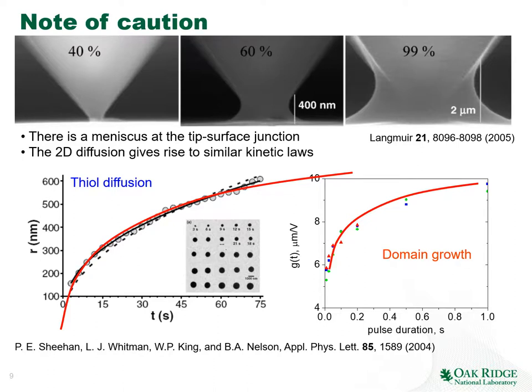It turns out if we just overlap these two curves, they show remarkably similar behavior. This is not a very rigorous comparison, but one thing for sure is that the dynamics of the surface charges can provide an alternative explanation for the observed domain wall kinetic studies. And I think this area is still waiting for systematic studies in vacuum environment, in controlled atmosphere, as a function of environmental stimuli and so on and so forth.